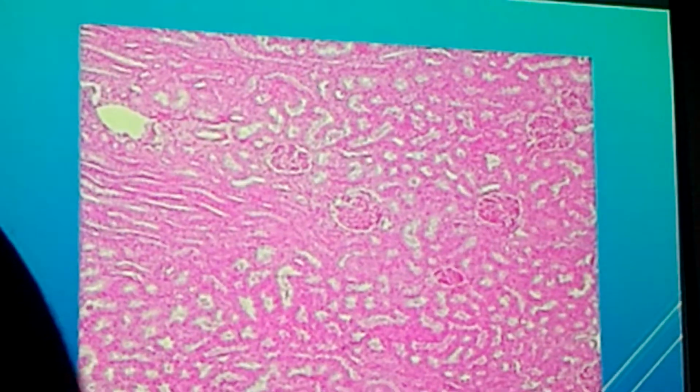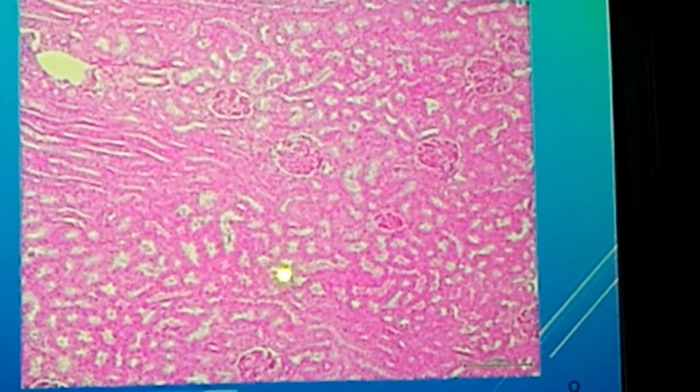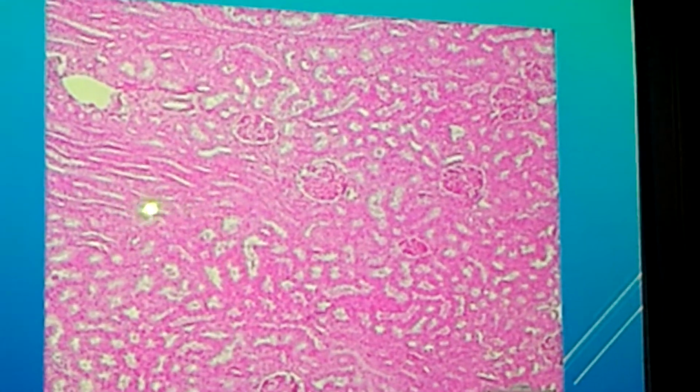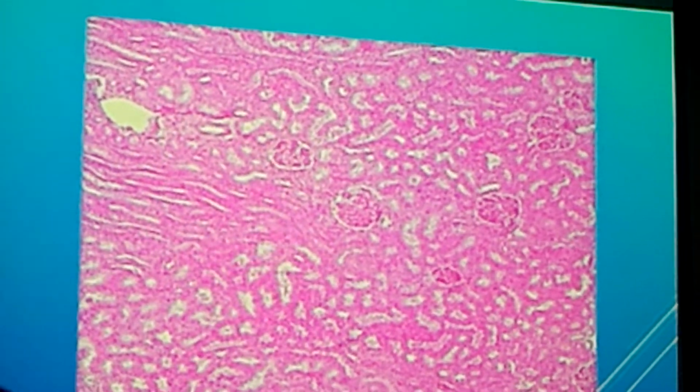This is actually your kidney, no? So, ang difference yung makikita nyo, you will have your ducts in longitudinal or cross-section. Ang pancreas is not like this. You will see more of acinar cells.